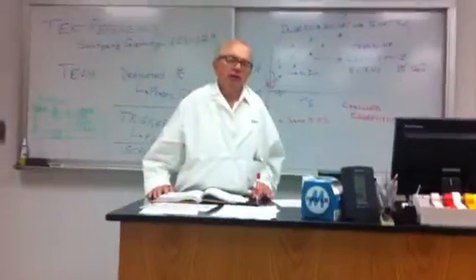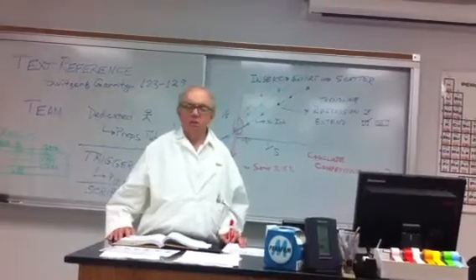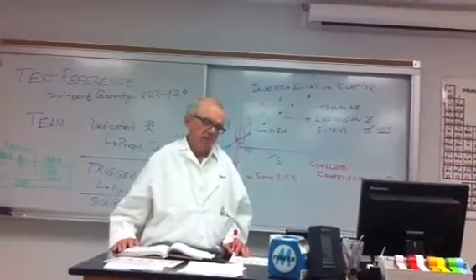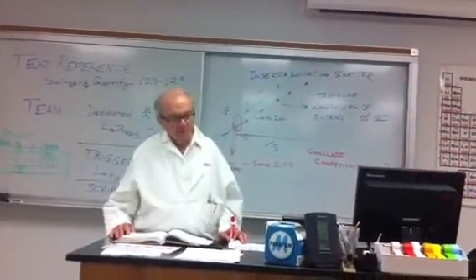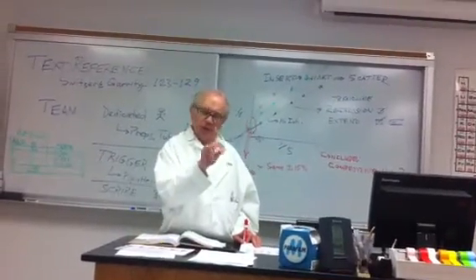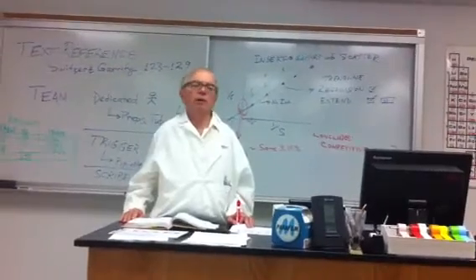I have seen some people say, we cannot accept or reject the hypothesis. The hypothesis is that these are potential drugs that are competitive inhibitors. If you're testing a hypothesis, we assume that all of these are competitive inhibitors and good drug candidates. And so you could say, yes, we accept that hypothesis on inhibitor 1. No, we reject that hypothesis on inhibitor 2. And then some people say, based upon our data, we cannot say. Insufficient. But they did a good job of reporting it. They showed all the graphs, they showed all the data, and they said insufficient. Cannot reject, cannot accept the hypothesis. Either way, we don't vote.